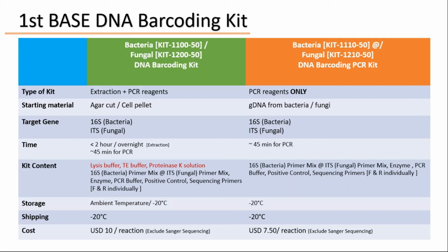As for the time you need, since this includes the extraction, you need either less than 1 hour, less than 2 hours, or for some protocols, overnight extraction, plus another 45 minutes for the standard PCR part.